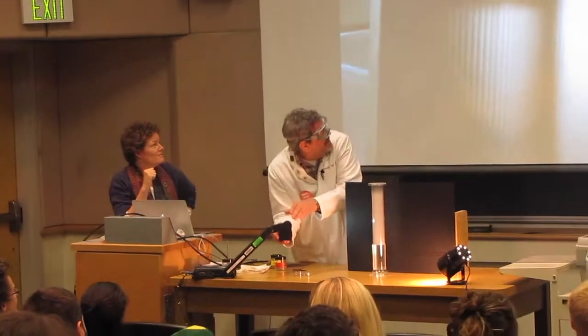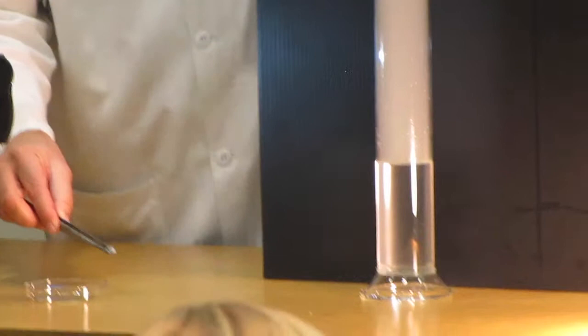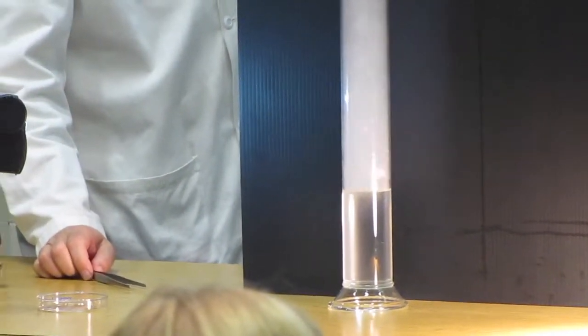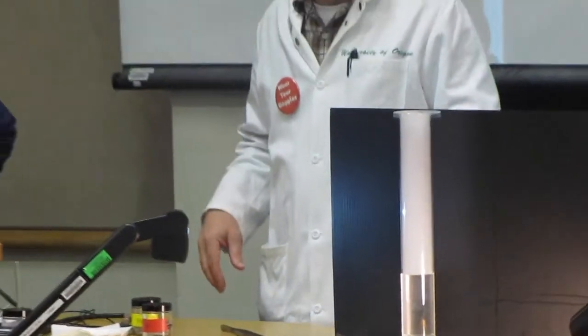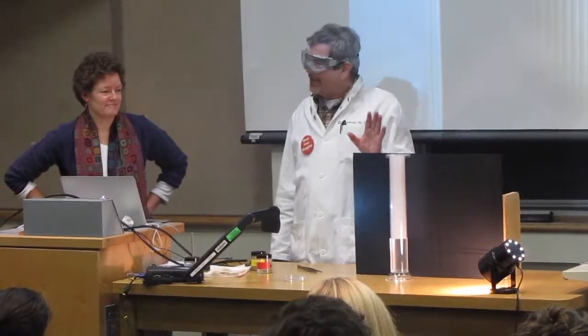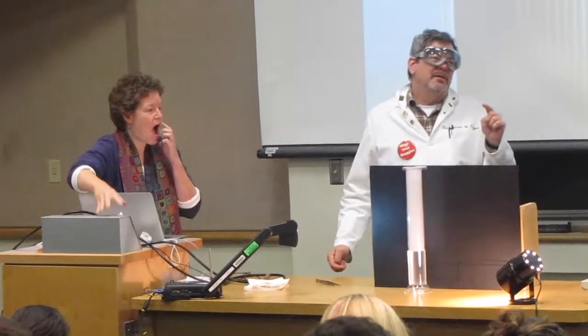Okay, so here we go again. And here is potassium. More reactive or less reactive than sodium? Think of the time. Those were about the same size chunks. Did that react quicker or slower? Much quicker, yeah.